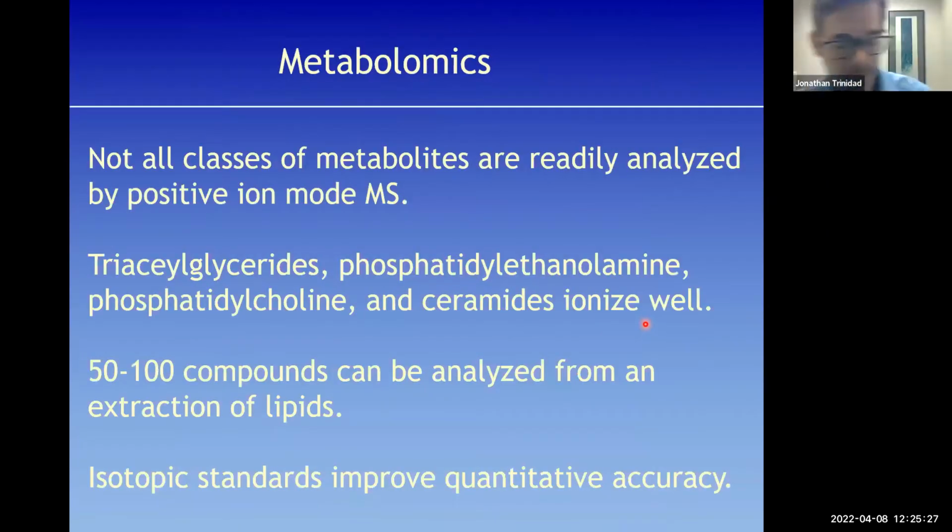All right, I'll give you an example of the metabolomics that we do. I should say there's another mass spec facility here that is based in chemistry itself, and they tend to deal more with small molecules. So metabolites is sort of an interface where we both do some work, depending on whose instruments are a little more tailored for that sort of particular analysis.